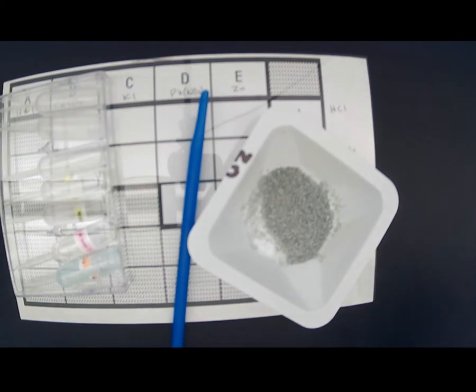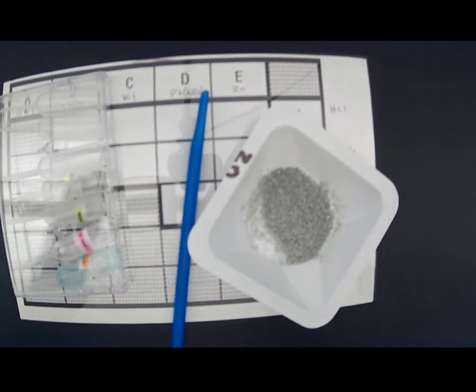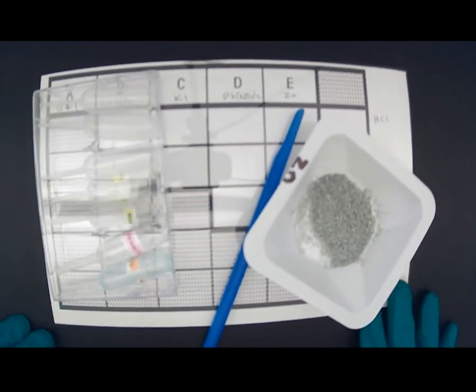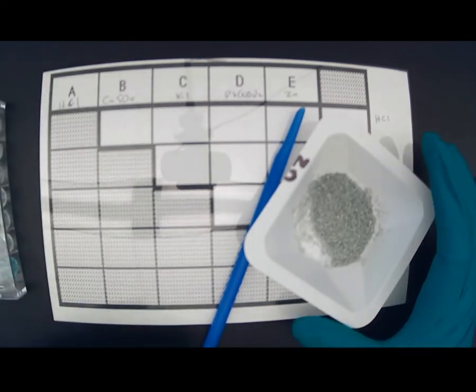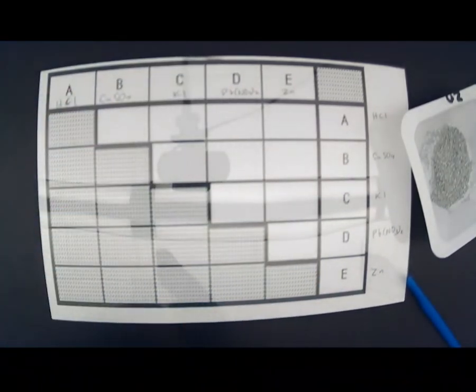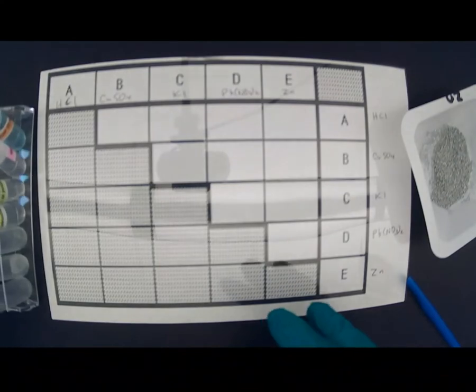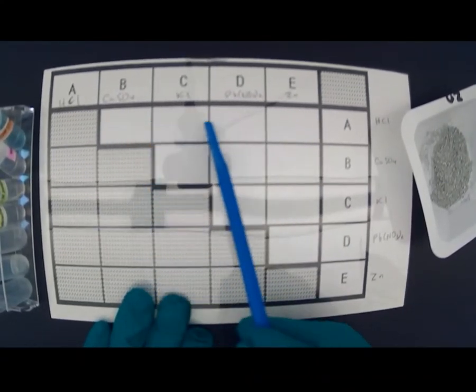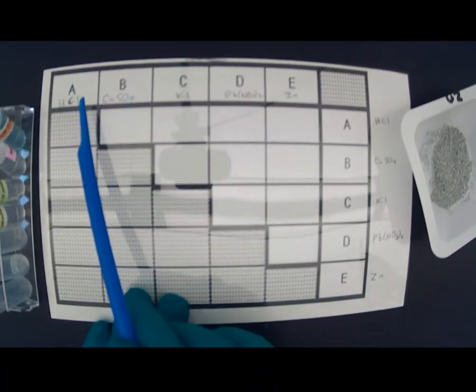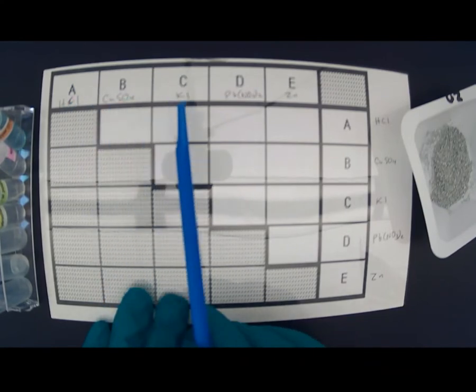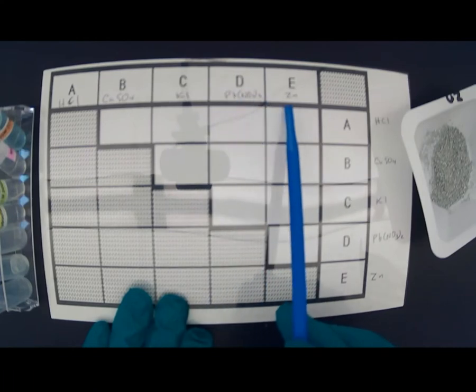I have a little setup here with a camera. I apologize it's a little fuzzy because in order to get this close it just doesn't focus very well, but I will take a picture of the whole setup once everything is done. I've got some powder zinc here, some chemicals and pipettes stored inside a cassette case which I'm going to use as a stand, and a grid to make sure we have all different combinations of the reagents. We're going to be mixing hydrochloric acid, copper sulfate, potassium iodide, lead nitrate, and zinc metal.